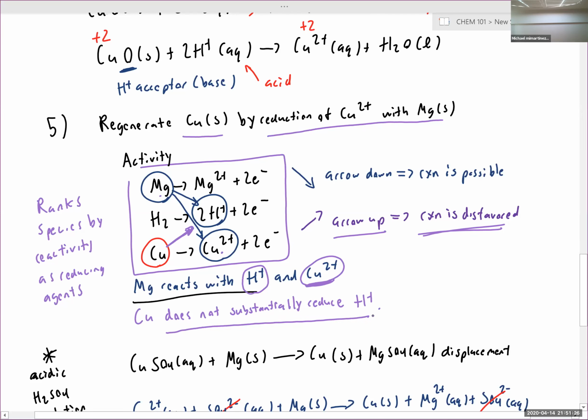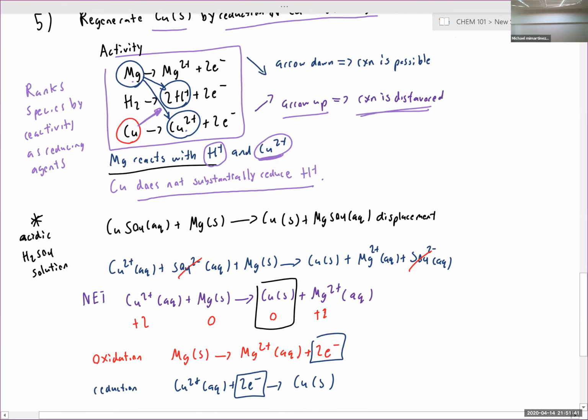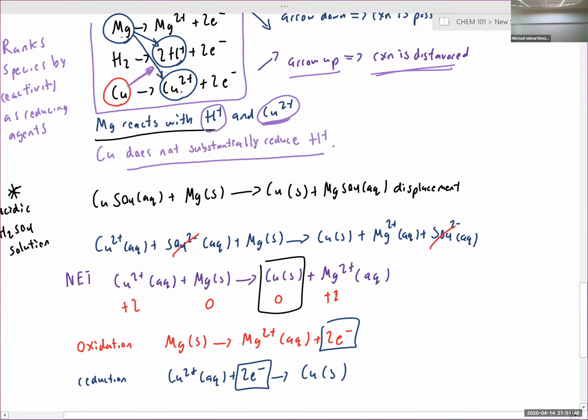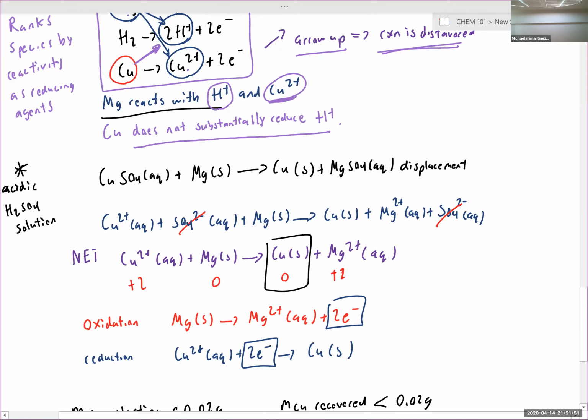So we can make copper 0 in acidic solution with no issues, while magnesium will react with acidic solution. And this is the beauty behind the trick for this reaction. Copper is a pretty easy metal to isolate via reduction because you can just burn off your excess reducing agent. So we're reacting our copper sulfate with magnesium in an acidic solution. And this will be important to keep in mind because this is why you'll see a pretty vigorous side reaction.